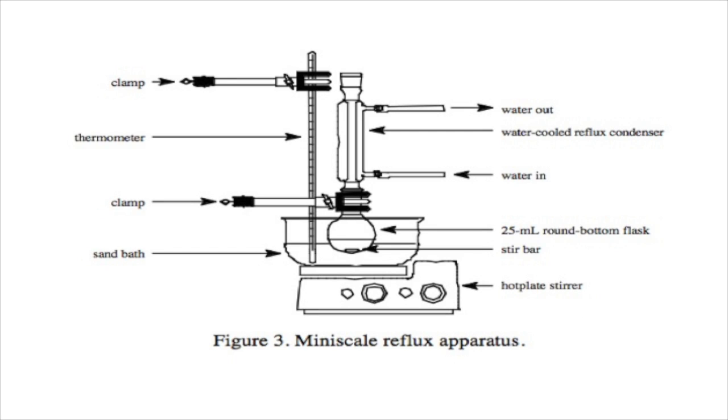When you set up your apparatus, here's a few good things to remember. The top should remain open, water should flow in through the bottom and out through the top, and you should clamp down at the round bottom.